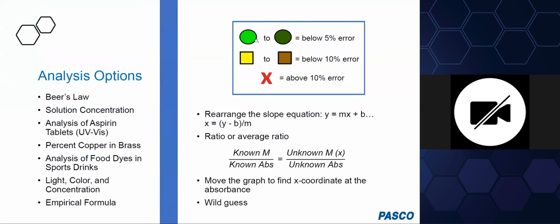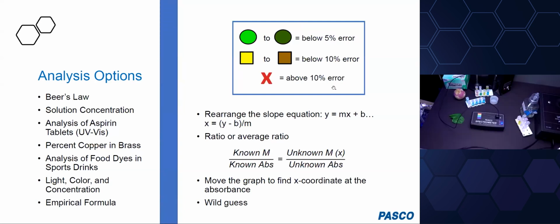Okay. How did I get that? This is just something I discovered by working and doing a percent error analysis, because I knew what my solutions were, and I just checked what they were.